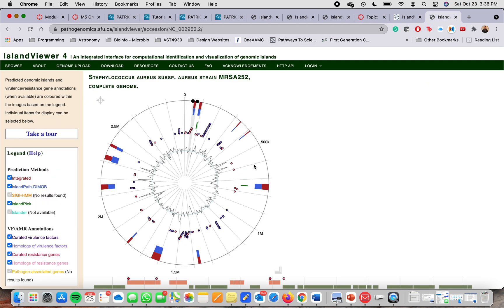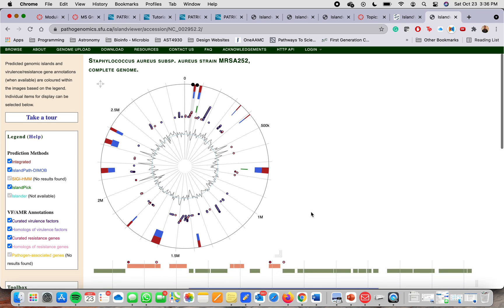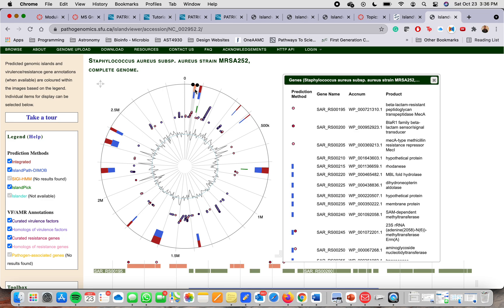So coming back to the results from the Staphylococcus aureus MRSA-252, here you can see the complete genome. If you click on the different genes, you'll find more information. If you click on the different results here, you'll find the prediction method that was used. It is color coded.